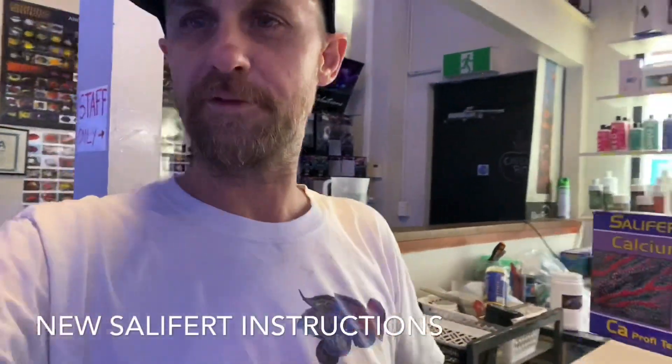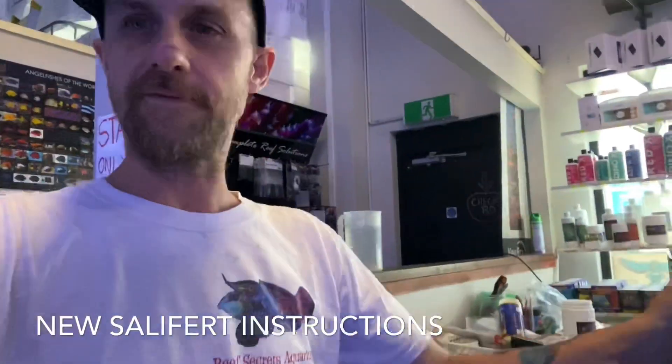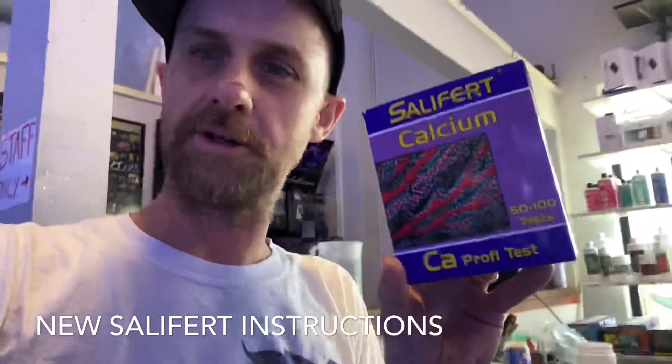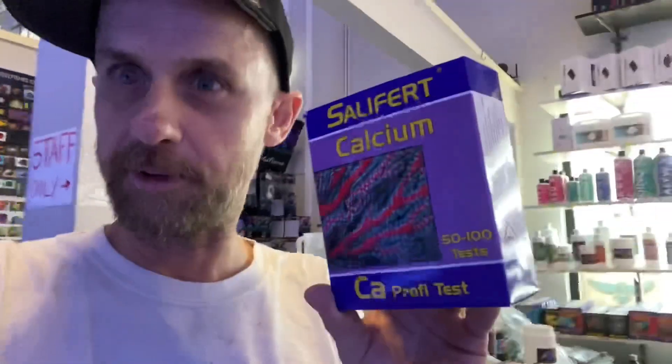Hey guys, it's Darren from Reef Secret Aquariums. I've got a new batch of Salifert calcium test kits, and the instructions have changed yet again. I'm going to show you the way to do the new Salifert calcium test — it is slightly different to the last one, so don't be fooled like me and think you can just buy the test kit and start using it.